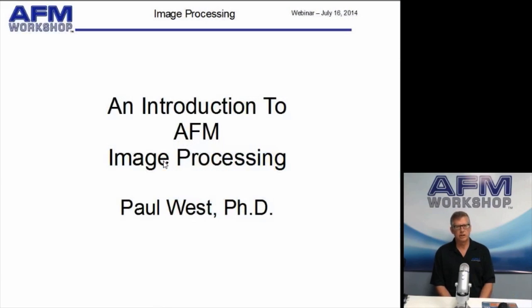So this is an introductory talk, and this is meant for people that are just starting to learn about atomic force microscopes and need to learn about image processing. The talk will last about 20 minutes, so it won't take up too much of your time.